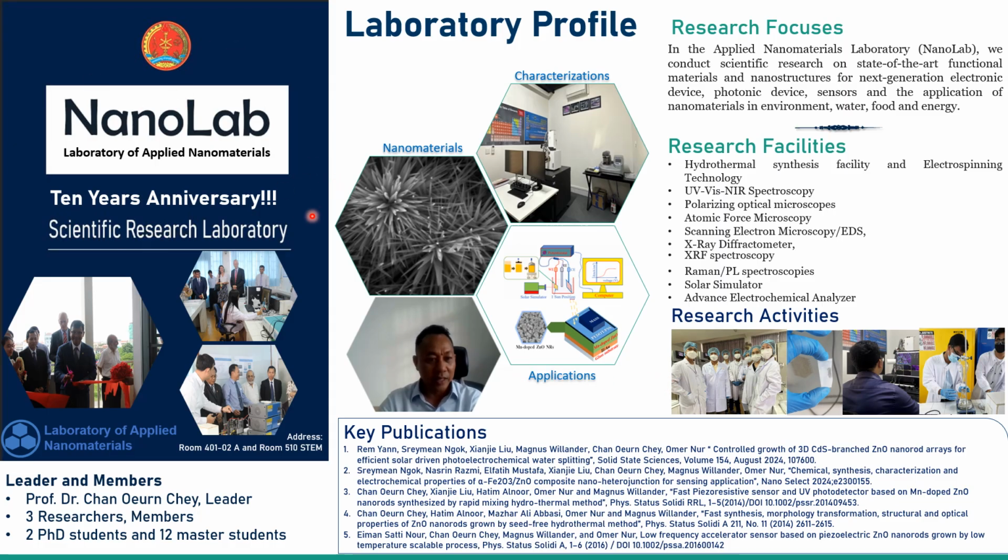So this lab was established in 2014. At that time we had very few people working in the lab, and a very small room in Building A. Now we have extended our lab to the STEM building, and our members have increased from a few people to more than 10 people.